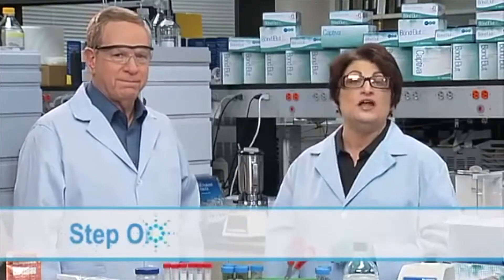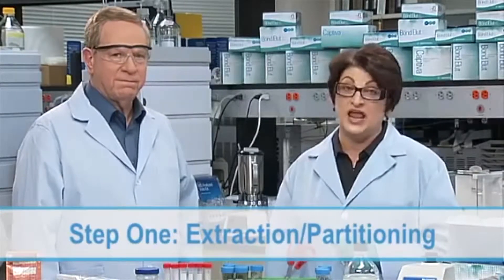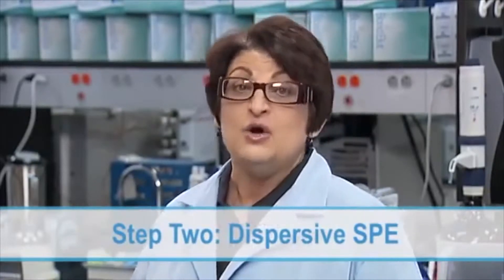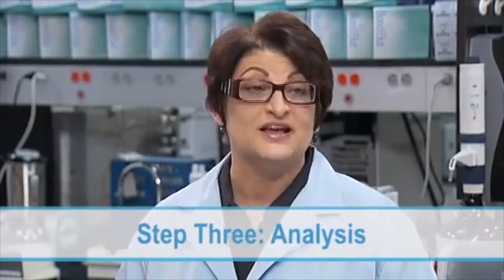The QuEChERS name stands for quick, easy, cheap, effective, rugged, and safe. Step one involves an acetonitrile salting out extraction of a sample in an aqueous environment. Step two is a liquid-solid extraction, referred to as dispersive solid phase extraction, or DSPE, which removes the majority of the remaining matrix interferences. Step three involves analysis by tandem techniques like LC-MS/MS or GC-MS/MS.